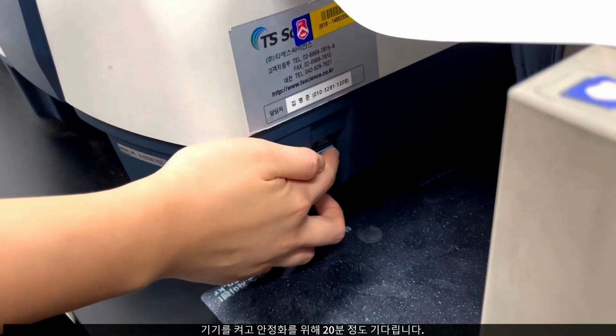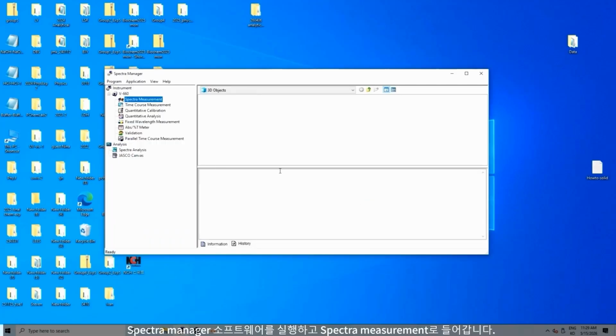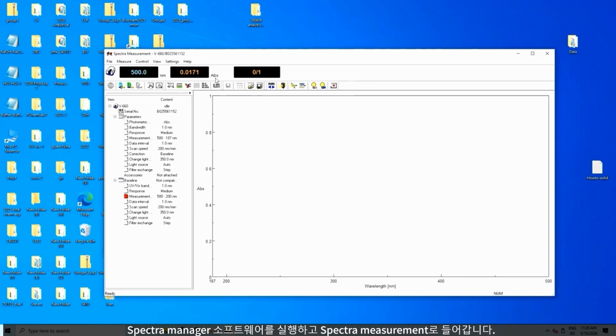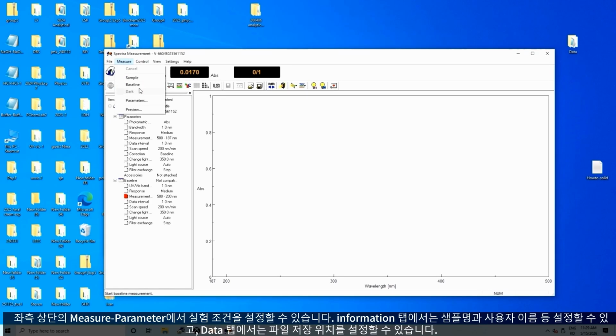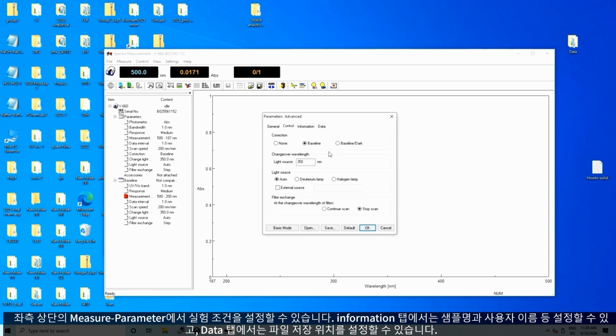First, the instrument is turned on and allowed to stabilize for about 20 minutes. Next, the Spectra Manager software is launched, and the spectra measurement menu is selected. Experimental conditions can be configured in the Measure Parameter section located at the upper left corner of the screen. In the Information tab, details such as the sample name and username can be entered.